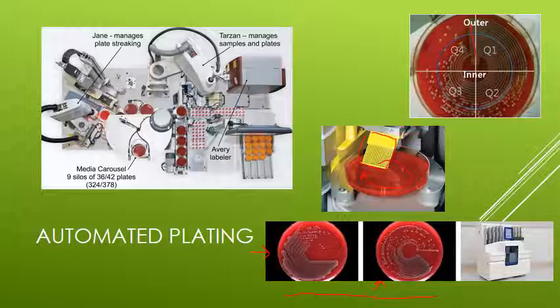And you can see it doesn't look the same as our quad plate, but we do still get similar results. The quadrants might not be as apparent, but you can see where it starts. And so from the start, you just make your quadrants in the normal, mathematical way. Just split the plate into quadrants. And you can still see we have very nicely isolated colonies out in the fourth quadrant for us to work with.